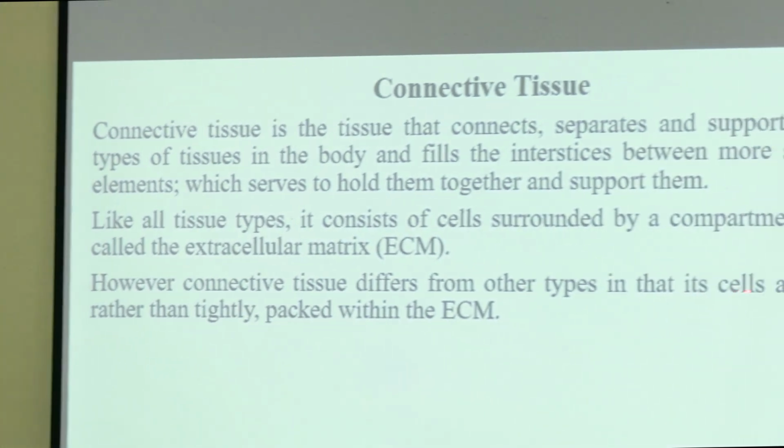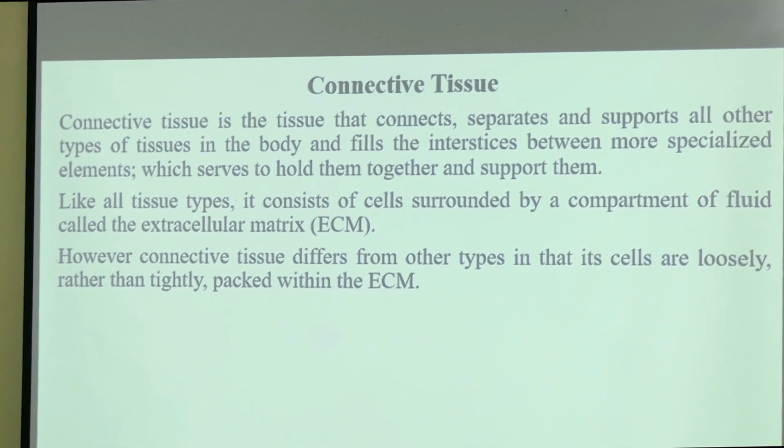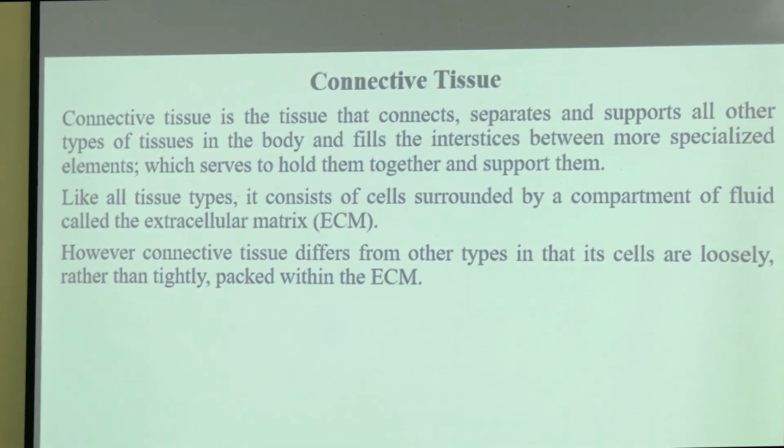Now, in case of connective tissue, what differs from other types of tissue is that the cells are loosely arranged rather than tightly packed within the extracellular matrix. Okay, so cells are loosely arranged. Let me show you a diagram.